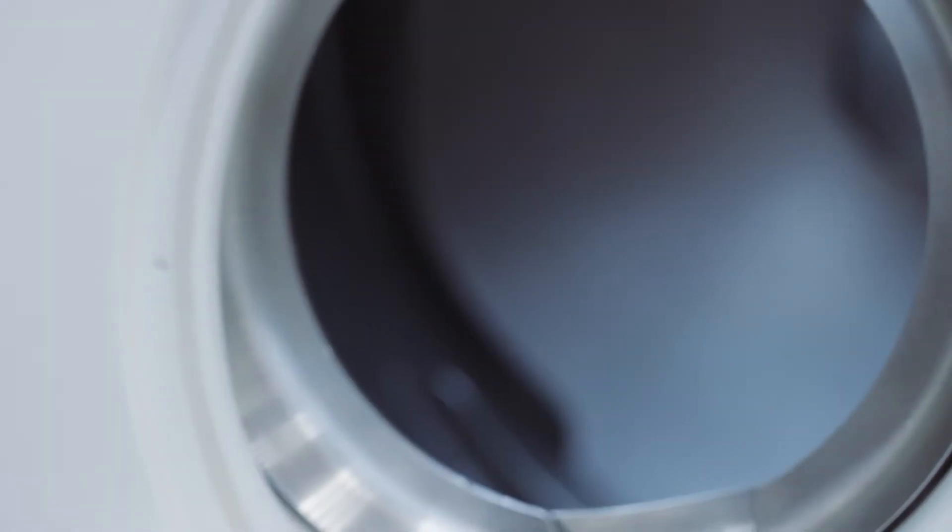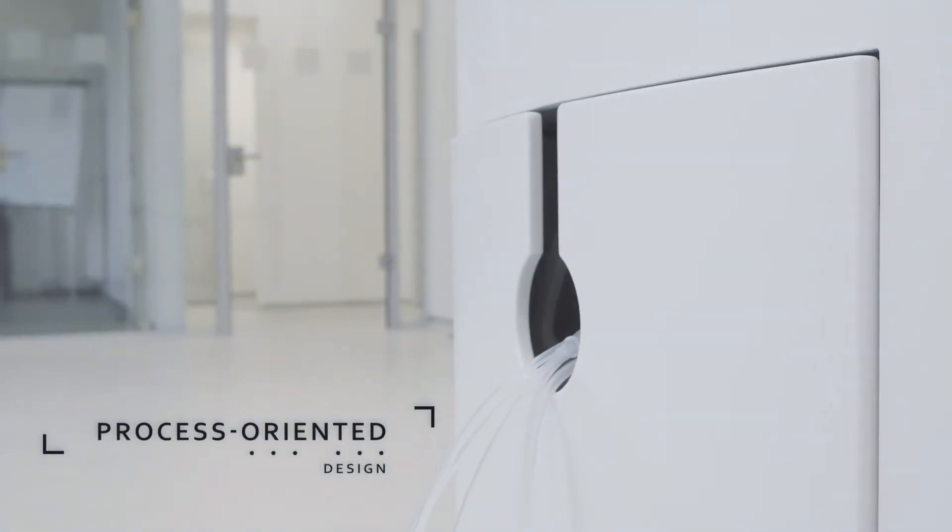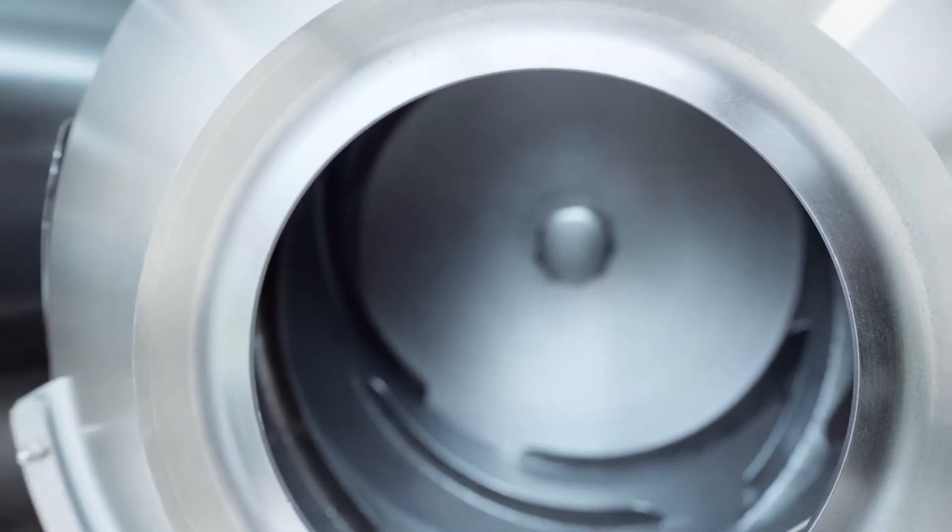This coder was designed with a focus on high functionality, user-friendliness in the truest sense of the word, and fast, efficient work processes.